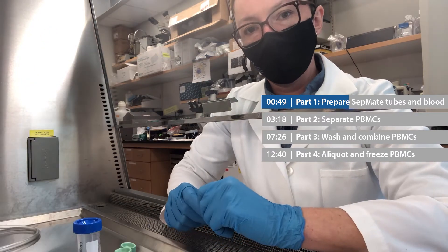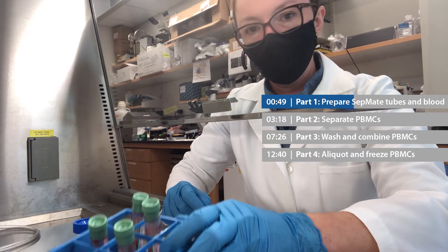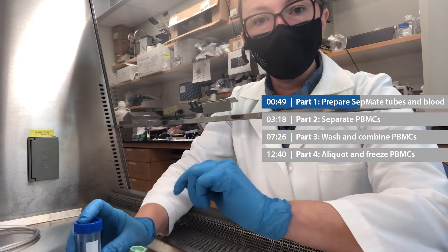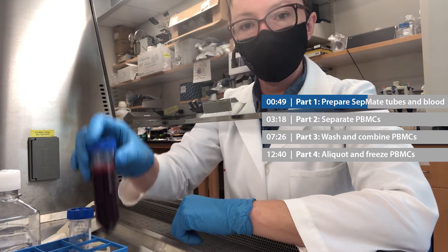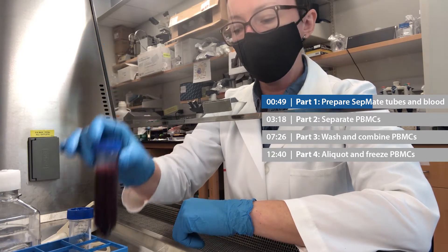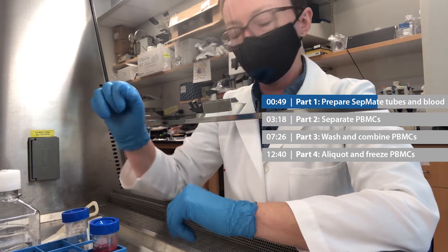Now to prepare the blood, I'm going to take my four blood tubes. Ideally, you should have 40 mils. I'm going to combine all of that blood into one regular 50 ml conical tube. So now I've got my 40 mils of blood in a conical tube, and I'm just going to split that into an empty conical tube, so I've got 20 mils and 20 mils.